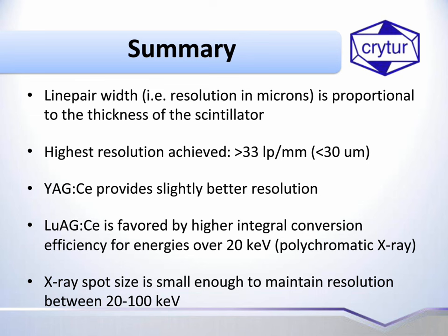What would be the theoretical limit of resolution of the system? I think it's going to be limited by the pixel size, fundamentally. Presently, the optics are at the limit or on the edge of the limit. As you said, Colin, it's about the pixel size or twice the pixel size, depending on the definition. Here, the highest spatial frequency is the Nyquist frequency, which is at 0.5 of the pixel size.